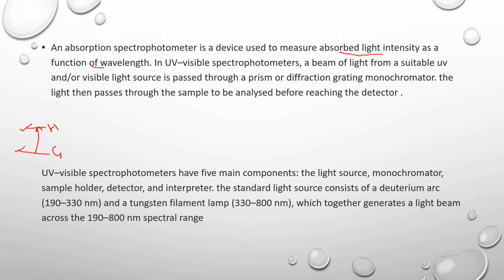So the equivalent wavelength energy is absorbed here and it creates the absorption spectra. When it goes to the higher energy state, it will come back to the ground state. The energy is emitted here that creates the emission spectra.